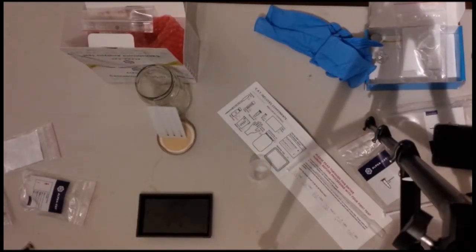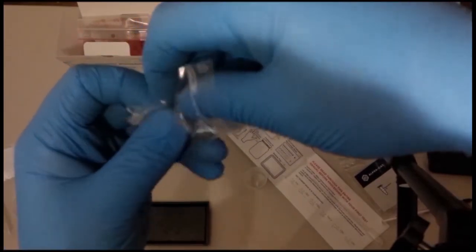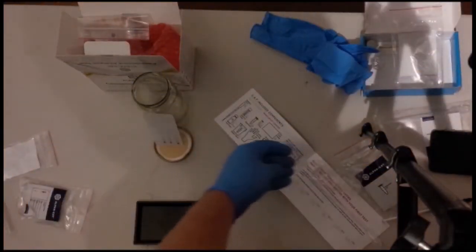The next stage is to prepare the dipping tray and dye powder. Take one of the two vials which contain the dye and make sure you empty all the contents into the dipping tray. Then, using the 25 milliliter beaker, pour 25 milliliters of water into the tray and gently mix it in to ensure the dye has properly dissolved.